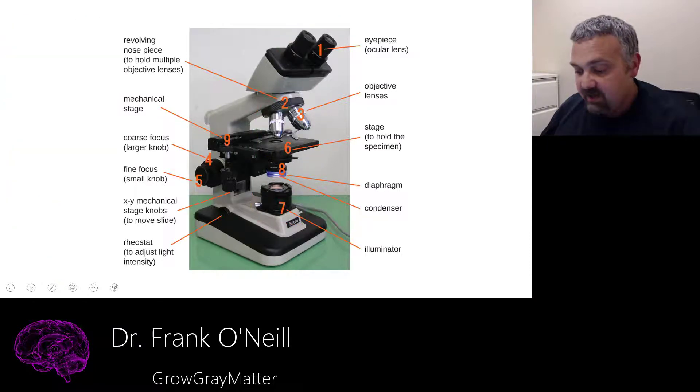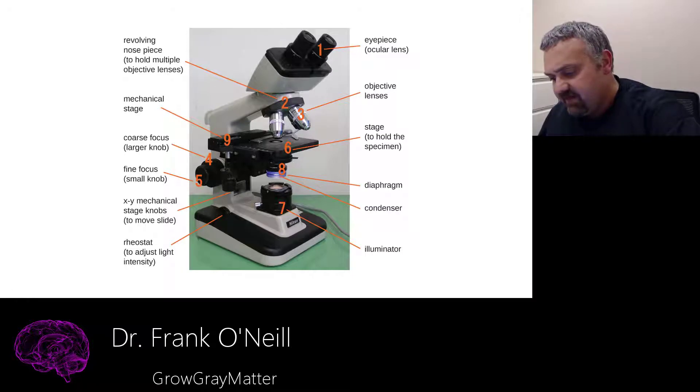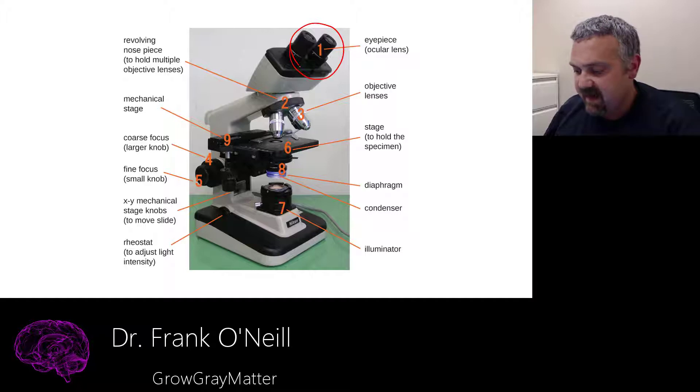All right, let's actually look at the individual parts here. So I'll just go in the numbered order. So number one, we do have the ocular lens, the eyepiece. That's going to give us 10, 20, 25x magnification.